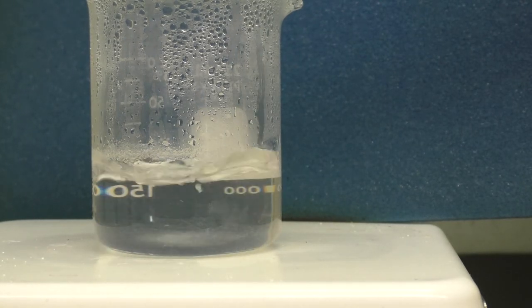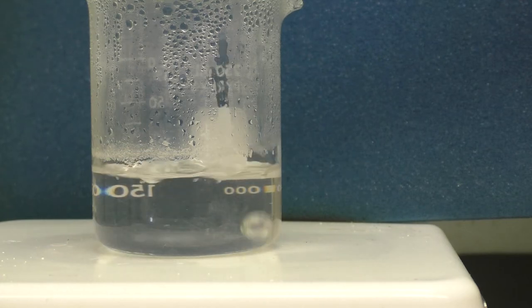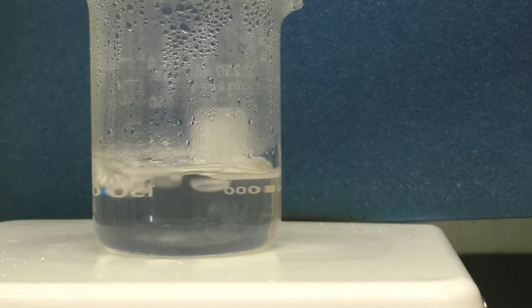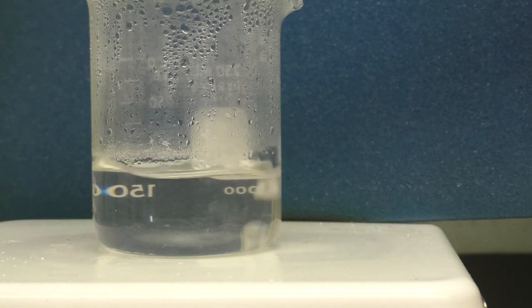Appears that all of the solid has dissolved. We will now turn off the heat and let the system cool slowly and crystallize.